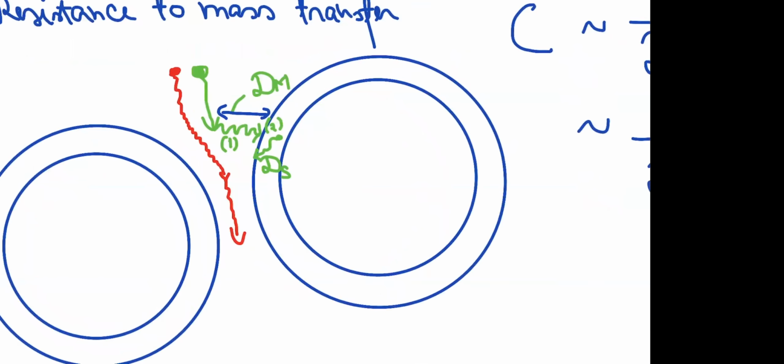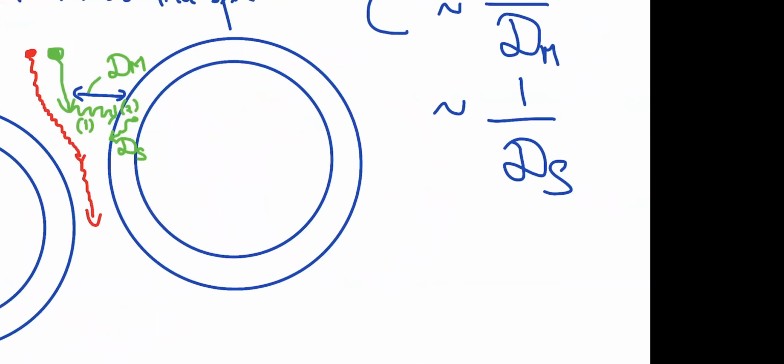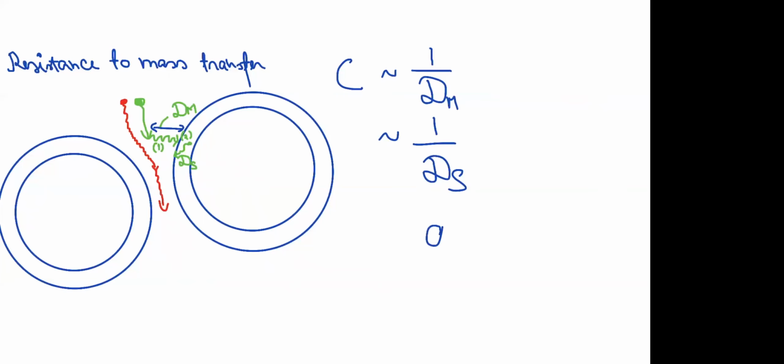So when the particle size of the stationary phase is small, then the peak broadening due to mass transfer is also smaller. So we want to have a well-packed column with small particles here as well.